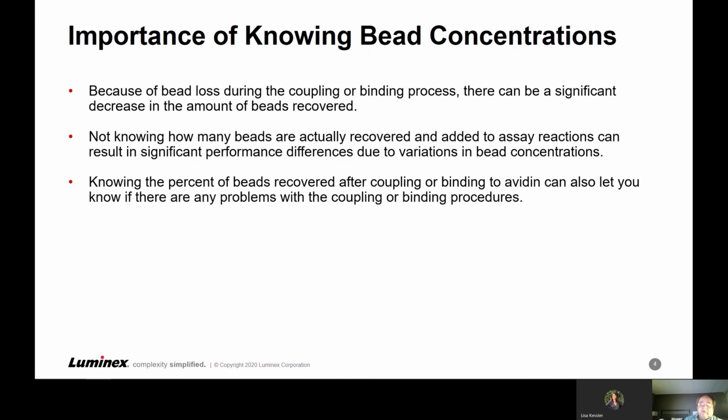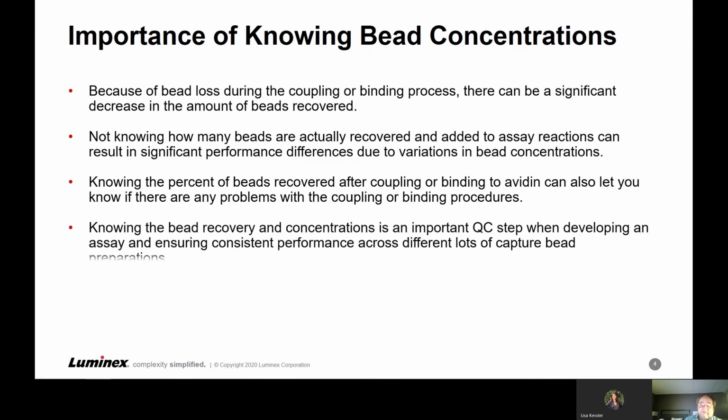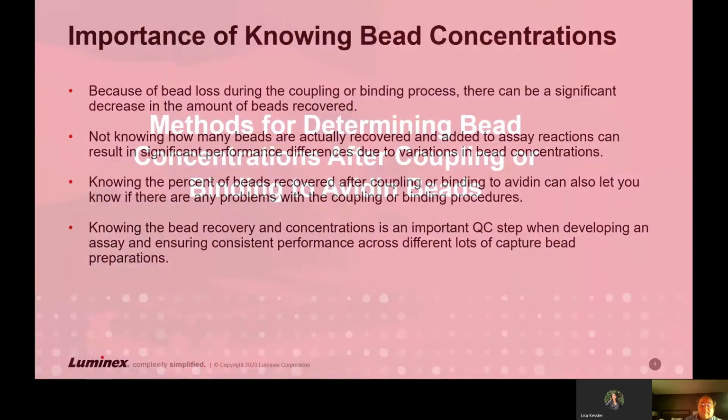So knowing the percent of beads that are recovered after coupling or binding to the Avidin beads can also let you know if there are any problems with your coupling and binding procedures. So knowing the bead recovery concentrations is an important QC step when developing an assay and ensuring consistent performance across different lots of captured bead preparations.